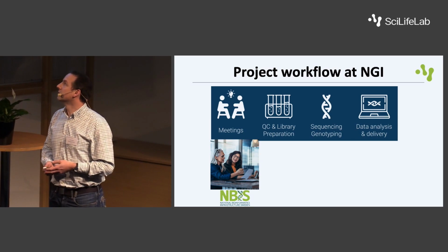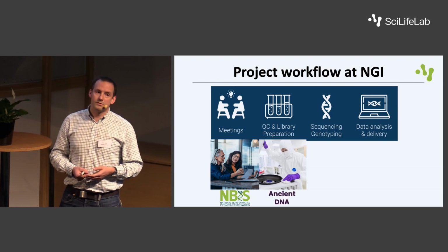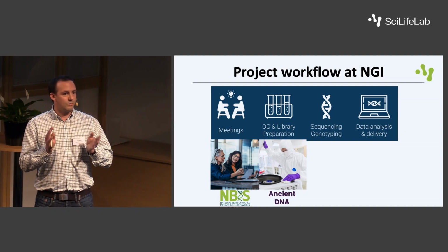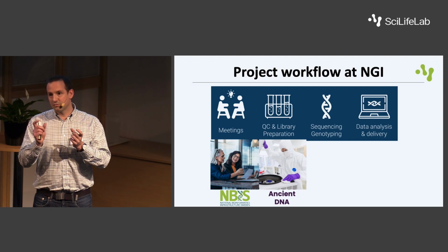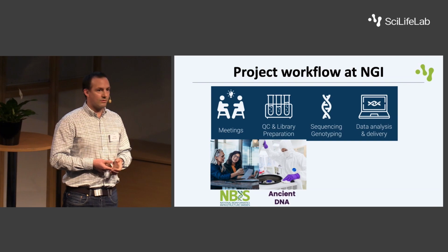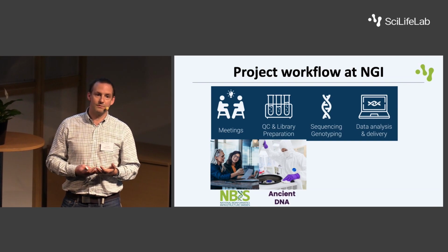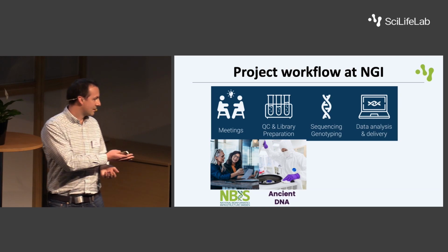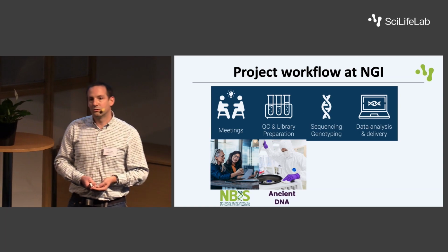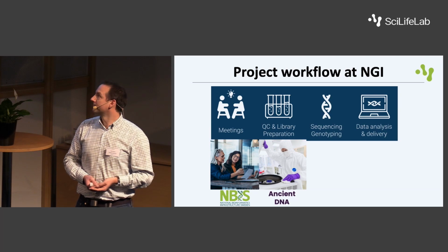The next step is you have your DNA and we need to get it into the sequencer. Now, we can't just put it straight into the sequencer. We need to make libraries from it. And we basically stick little adapters onto your DNA, and then we can put it into our sequencing machines. You can do that yourselves, and you can give us your libraries. You can talk to Magnus at the Ancient DNA facility. They can help you with all that. Or if you want to, you can give your DNA directly to us, and we can make the libraries for you.